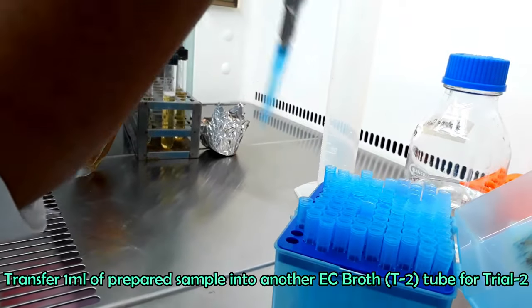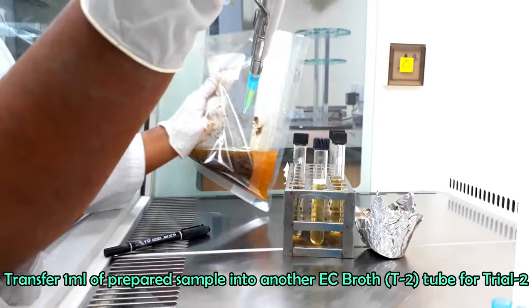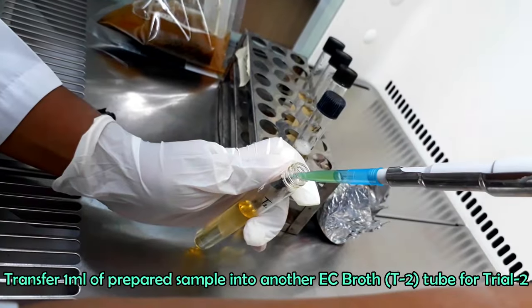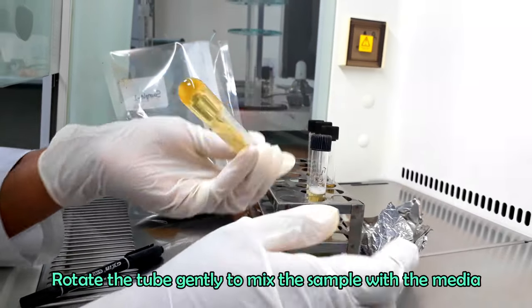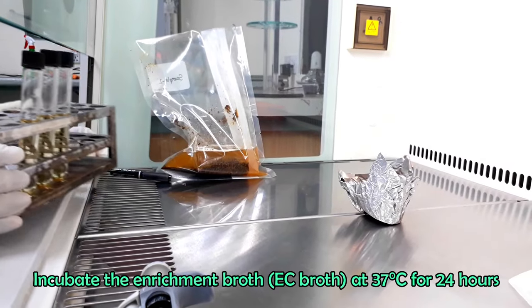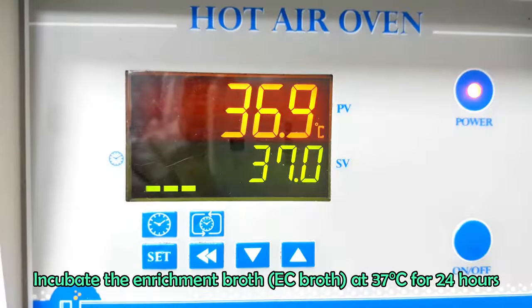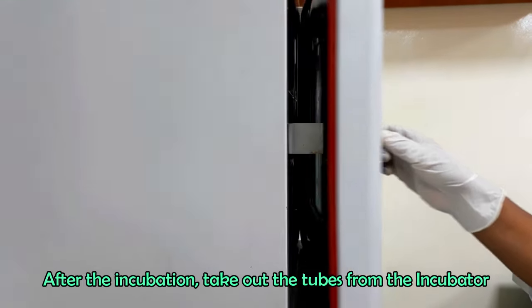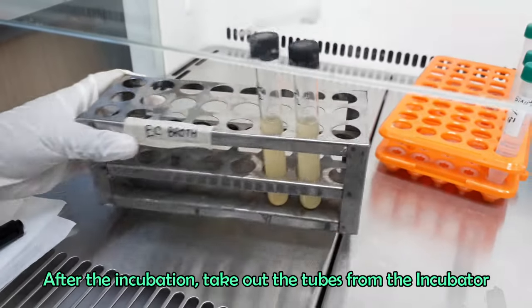Attach another sterile tip and transfer another ml of prepared sample into trial 2 EC broth. Discard the tip again. Close the tube loosely. Rotate the tube several times to mix. Incubate the tubes at 37 degrees Celsius for 24 hours. Take out the tubes after incubation. Enrichment is done successfully.